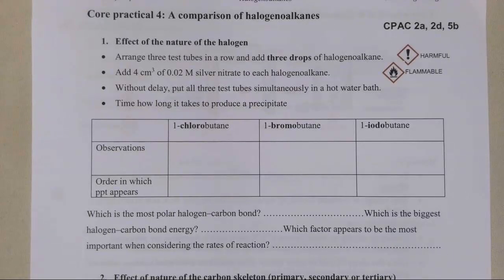Okay, so we're going to have a look now at the comparison of the different halogenoalkanes. We're going to look at 2 experiments. First of all, the effect of the nature of the halogen itself. So in this case, I'm going to have 3 test tubes which have different halogenoalkanes in them. 1 chloro, 1 bromo, and 1 iodo. To each of those, I am going to add 4 centimetres cubed of silver nitrate to each halogenoalkane. I'm going to put them all into a warm water bath, and I'm going to time how long it takes for the precipitate to form.